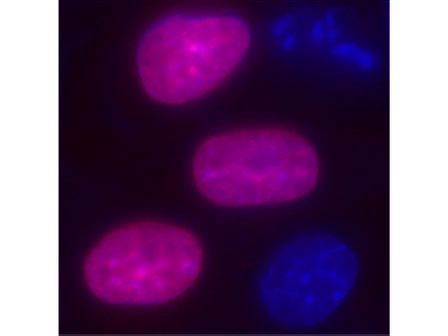The pSNAP-H2B construct was generated using the pSNAP tag M vector. The cells were labeled with SNAPCELL TMR-star for 30 minutes and counterstained with Hoechst 33342 for the nuclei. The pink fluorescence demonstrates the overlay of red fluorescence where histone protein is present, in addition to the blue fluorescence indicating the nucleus. The expression of the H2B protein is clearly and easily identified.